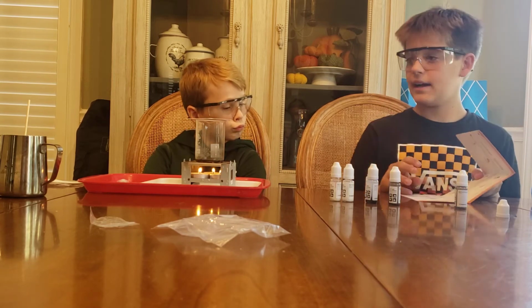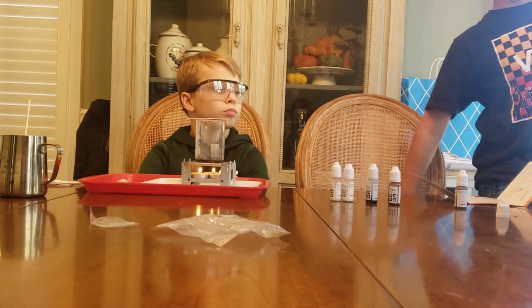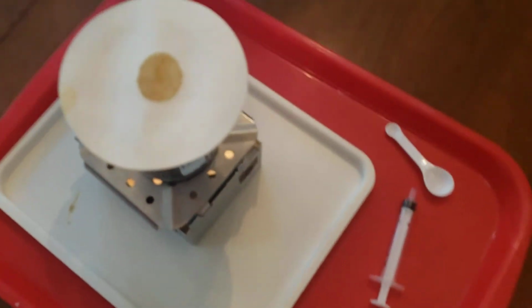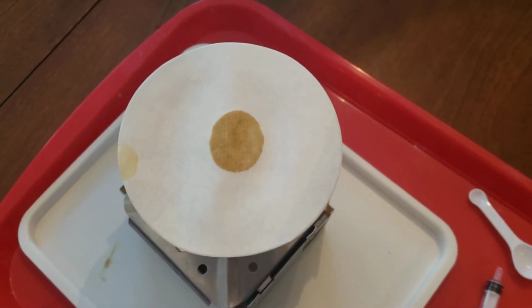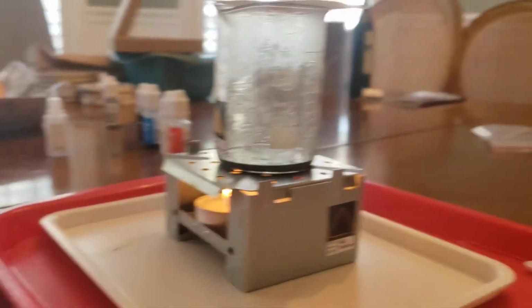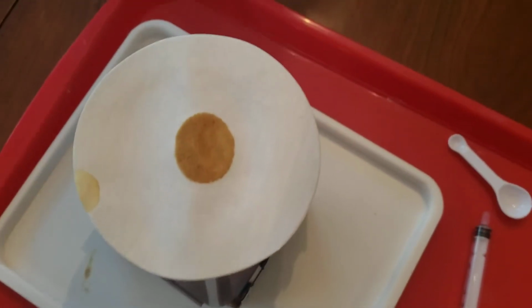So at 2 to 3 minutes, we're gonna unpause it. That's how you stop it again. So there's like this brownish color. Let it focus. See that brown? That brown is what these chemicals that we just put in are making. So yeah, it's like getting browner and browner.